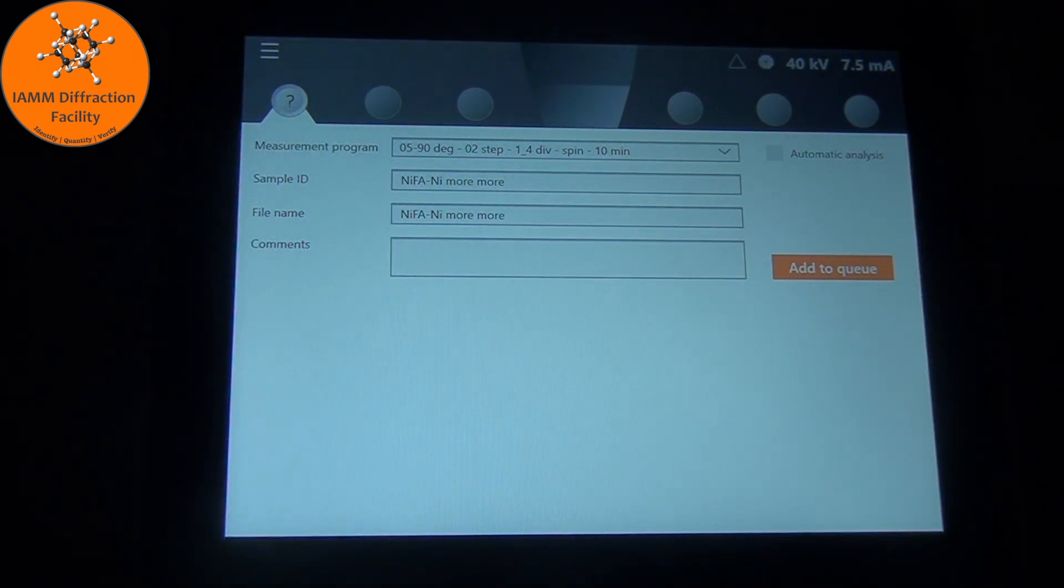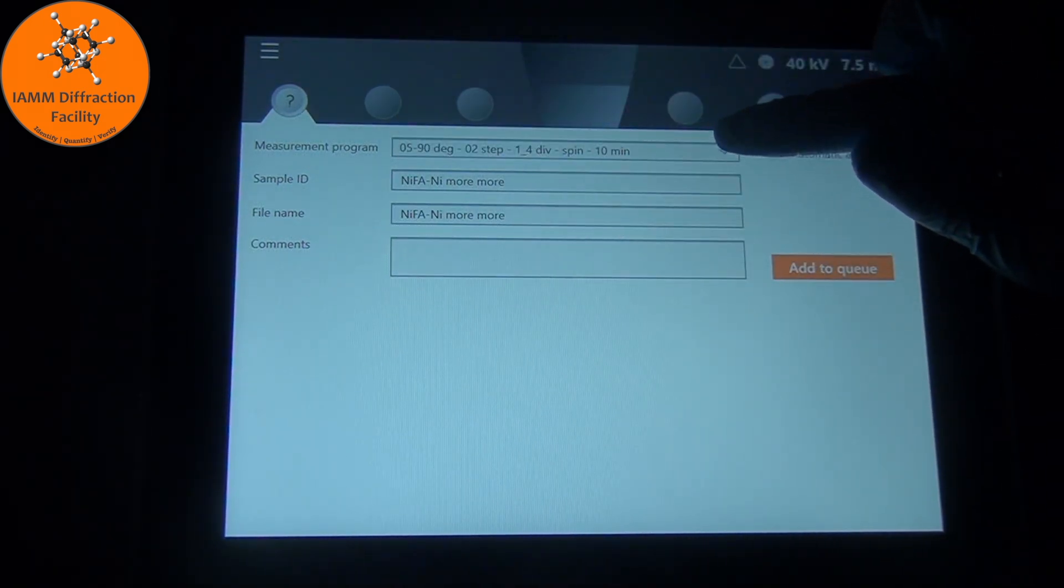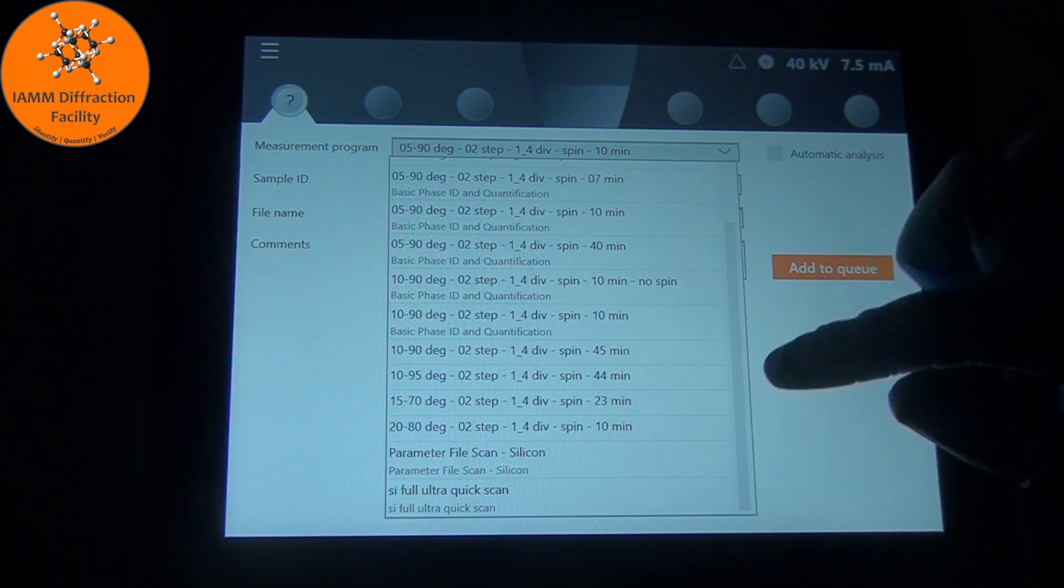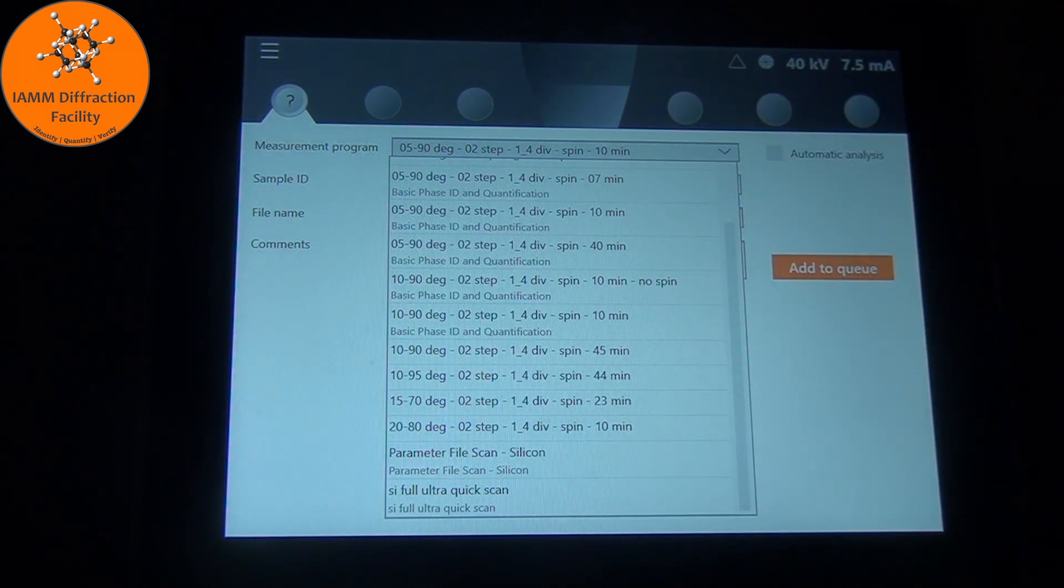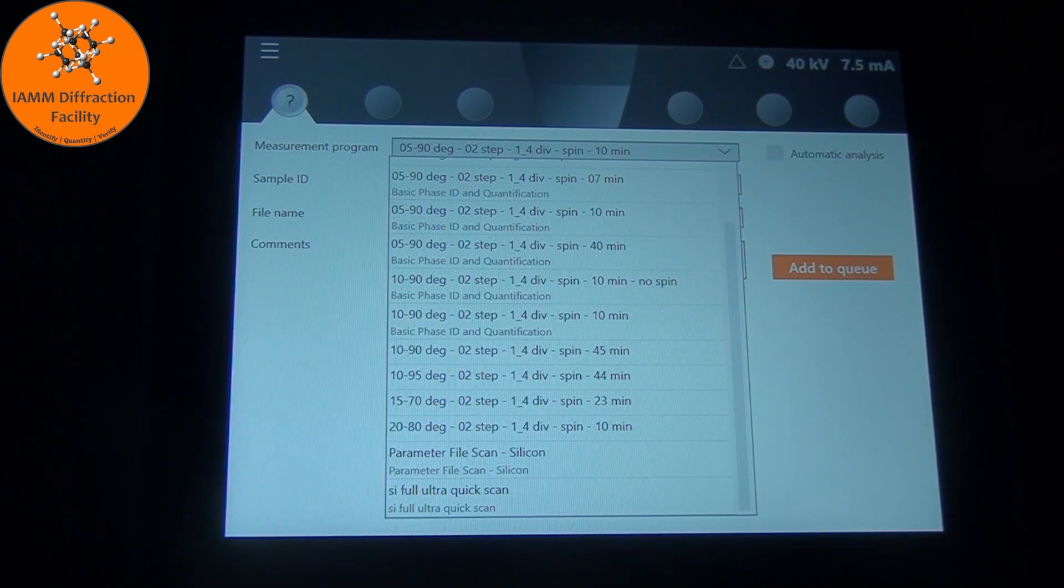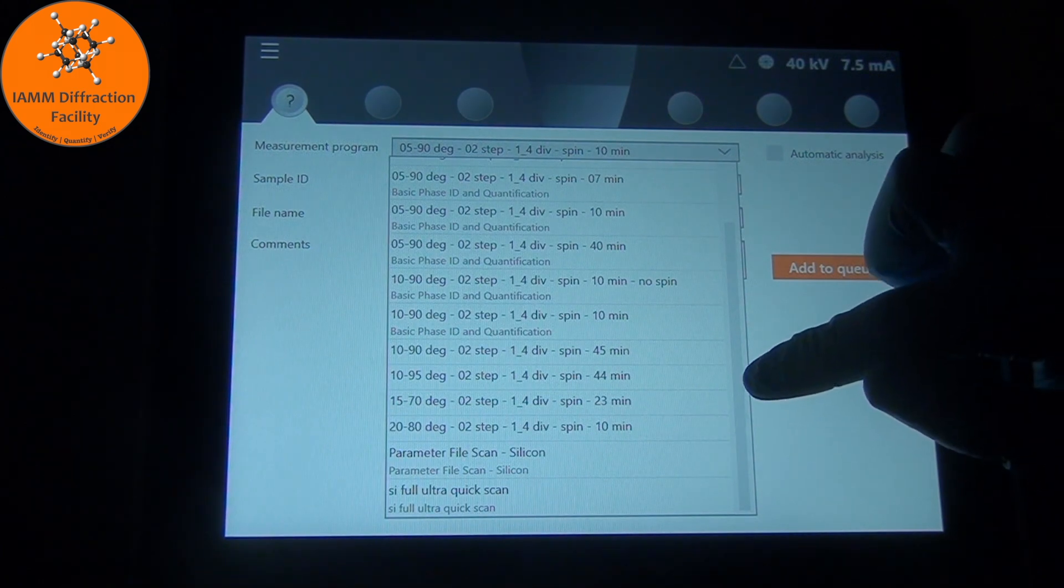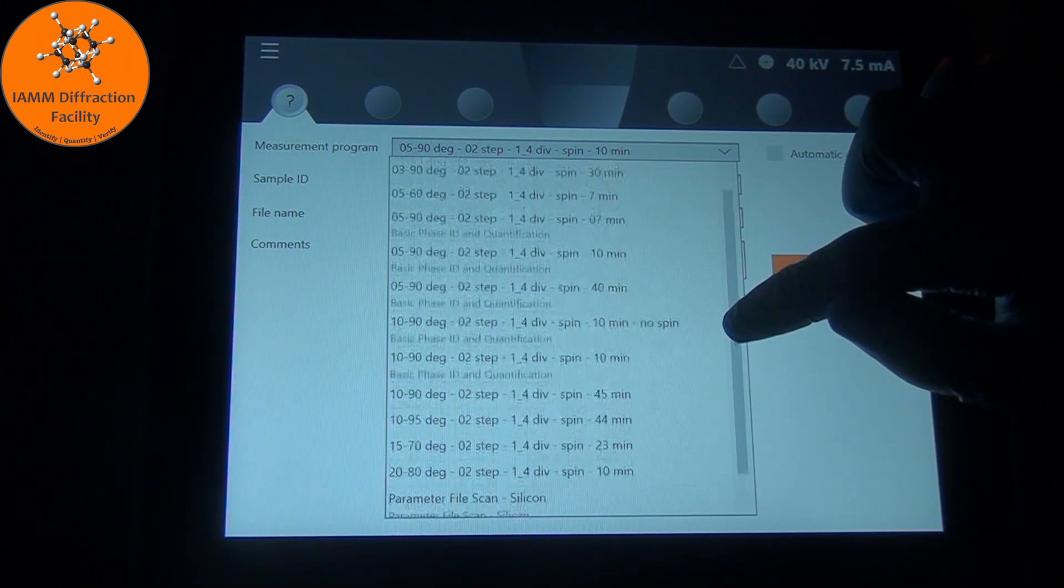Here is where we can select our measurement program, so we will click the little down arrow. You'll see here I have a list of different programs. If you need to scroll, click on this scroller bar and go up and down.